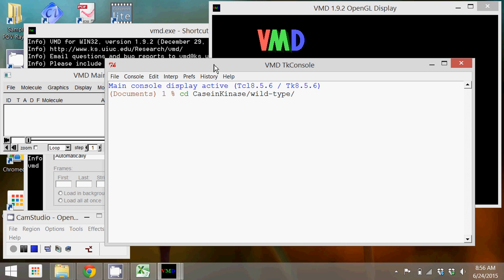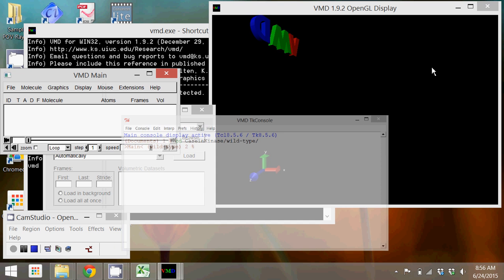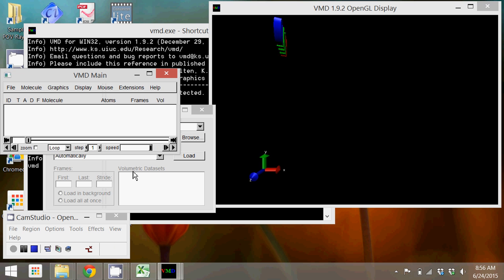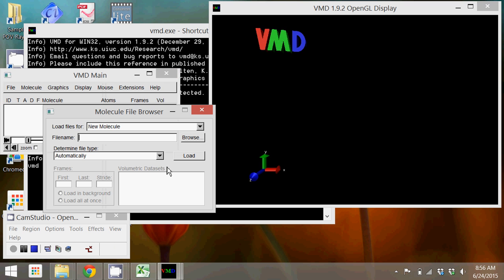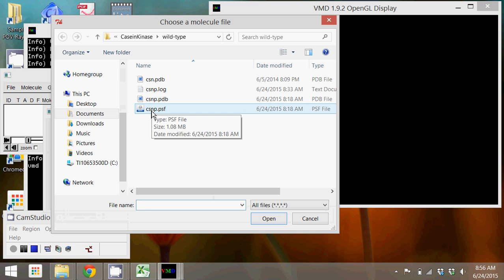So that puts me there, makes it easier to load files because if I click browse now it goes straight there. So I open the protein structure file first, load it.